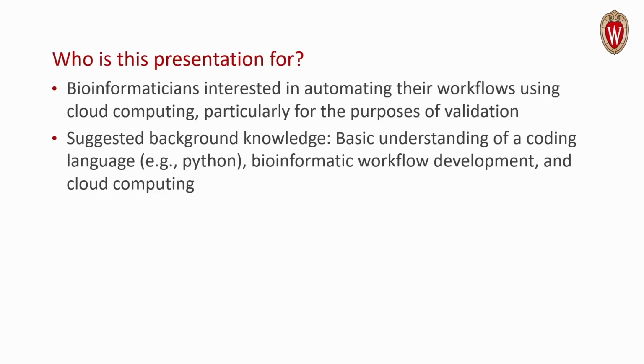So who is this presentation for? This presentation is primarily designed for bioinformaticians who are interested in automating their workflows using cloud computing, particularly for the purposes of validation, because our Streptococcus pneumoniae pipeline is validated. To get the most out of this presentation, you should have a basic understanding of a coding language such as Python, a basic understanding of bioinformatic workflow development, and an understanding of cloud computing.